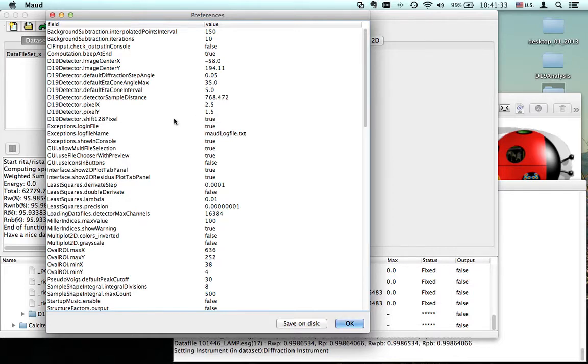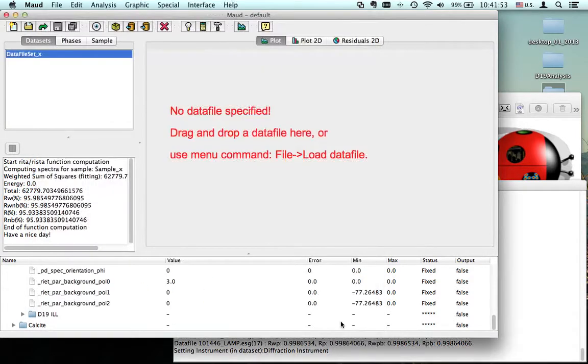If it is true, it will interpolate to get that line. If you put false, it will do nothing on that line. So in the future, if the line will be fixed, then you can put to false. Okay, so these are okay to do the integration.